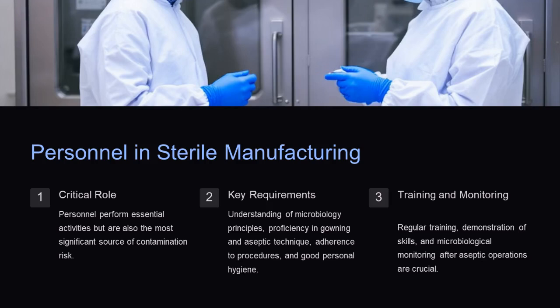Personnel perform essential activities but are also the most significant source of contamination risk. Understanding microbiology principles, proficiency in gowning and aseptic technique, adherence to procedures, and good personal hygiene are key. Regular training, demonstration of skills, and microbiological monitoring after aseptic operations are crucial.